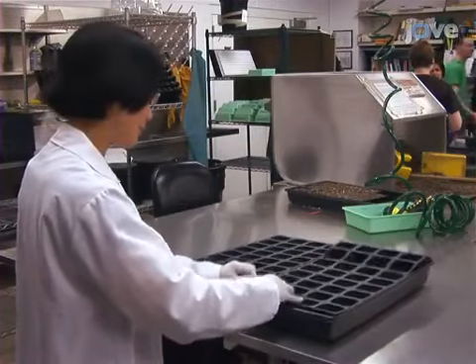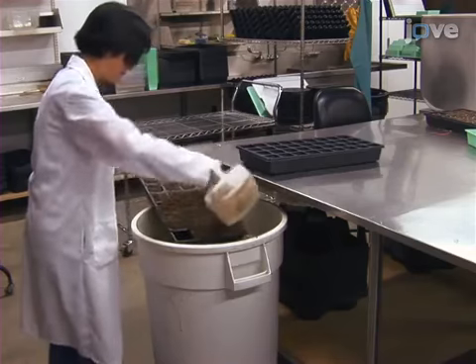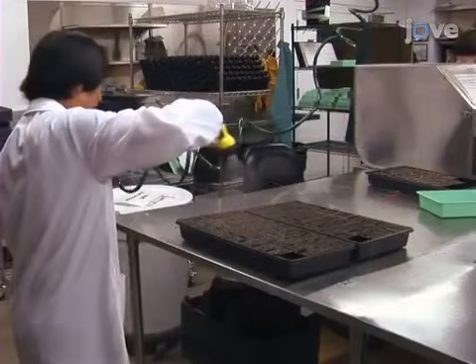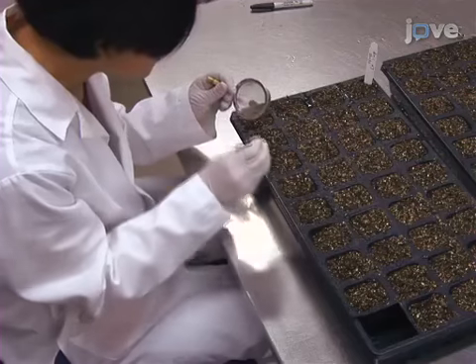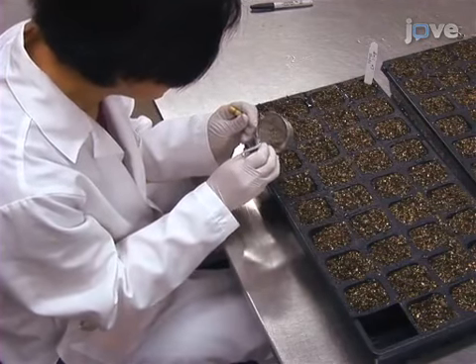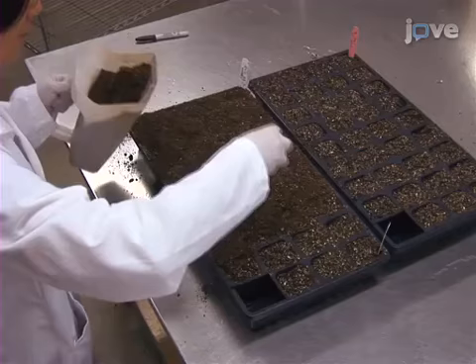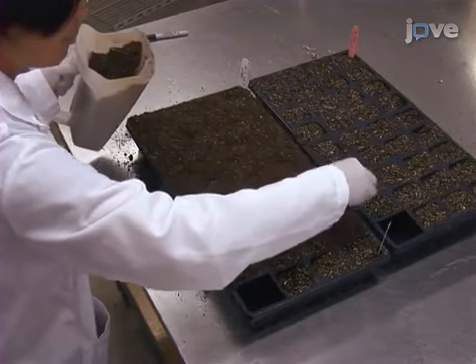To begin, remove one cell for watering and then fill a tray with 4 by 9 cells with MetroMix 360. Next, lightly mist the cells and sow seeds on the surface of the soil, one seed per cell. Then, cover the seeds with a layer of soil 0.5 centimeters thick.